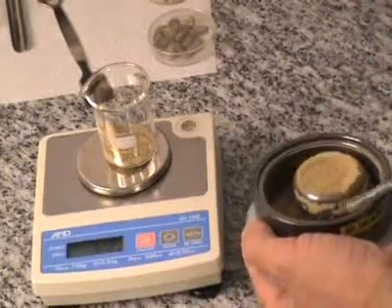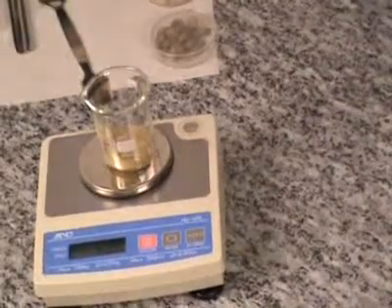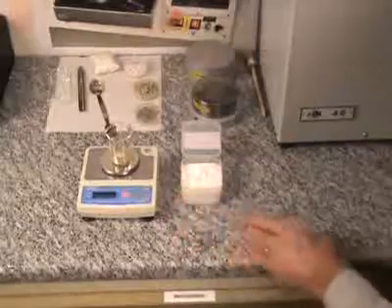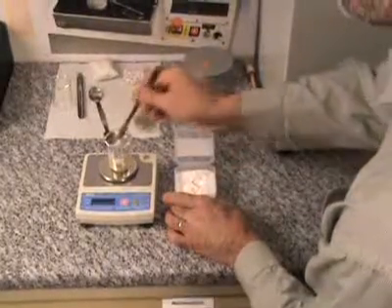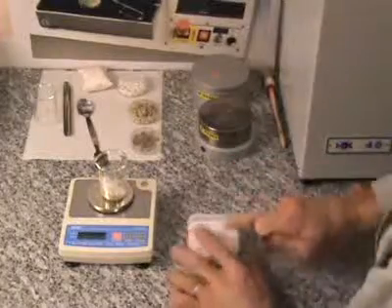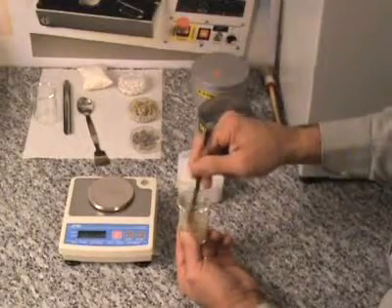5 grams of sample are used to make this pellet. And in order to enhance the binding and pelletizing properties, 0.5 gram of micro wax powder HWC is added. The micro powder is mixed with the sample to produce a firmly bonded pellet.